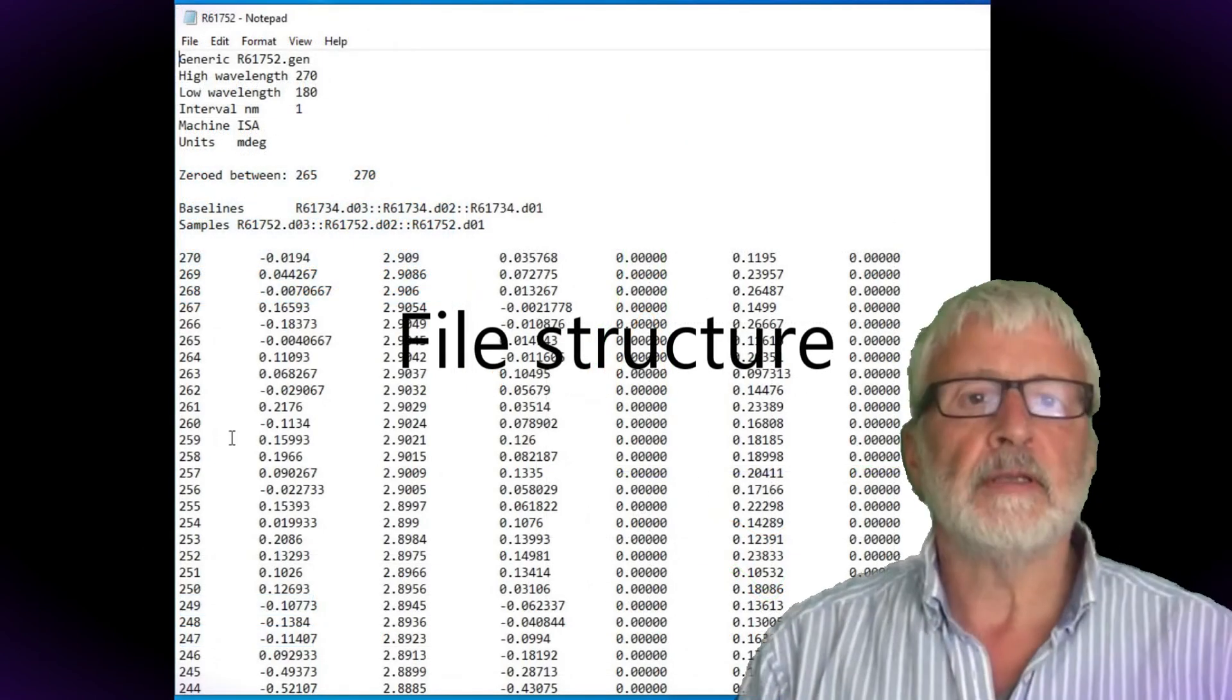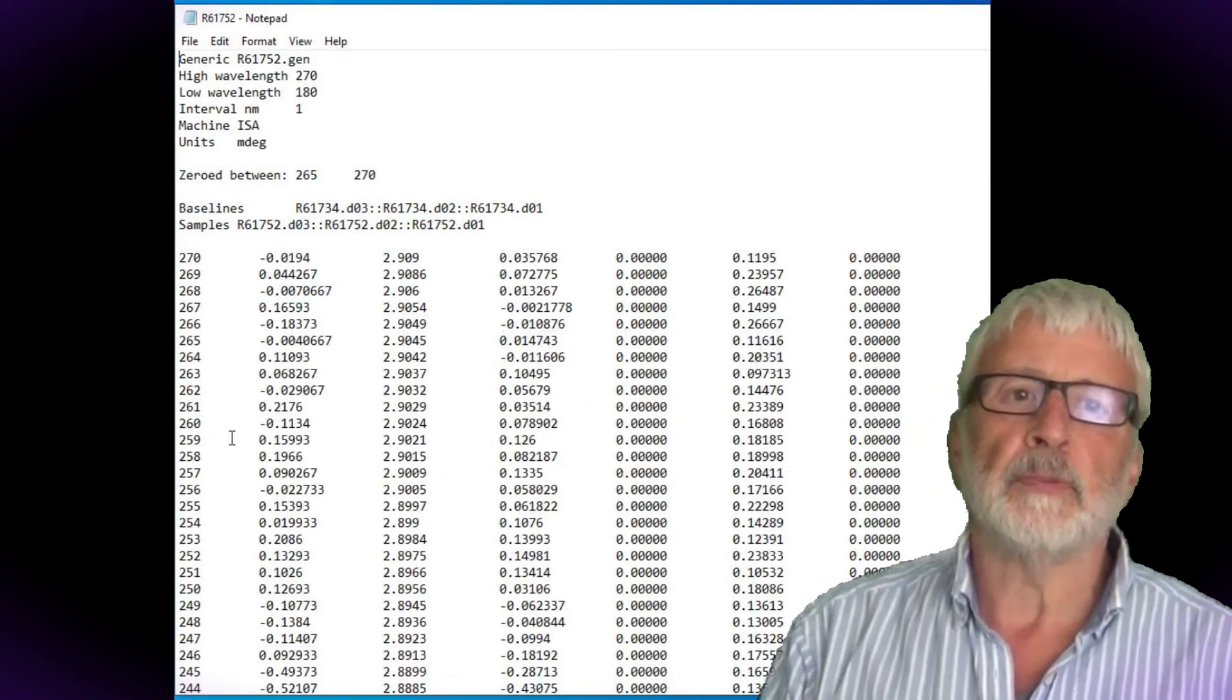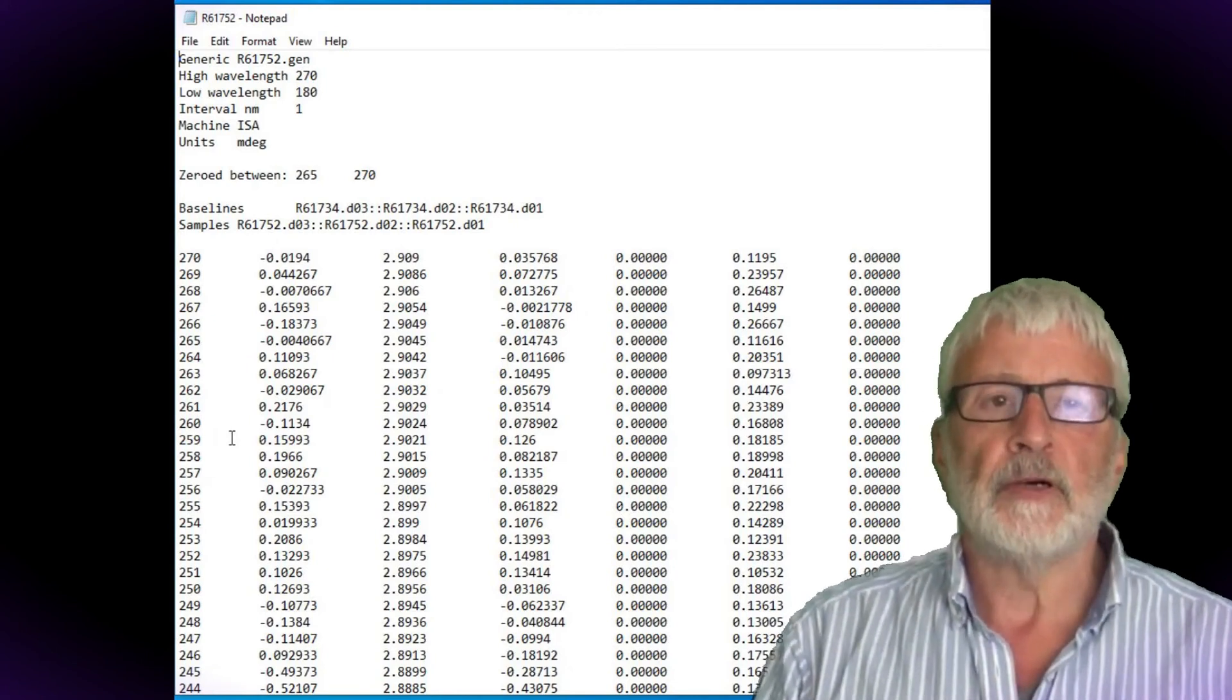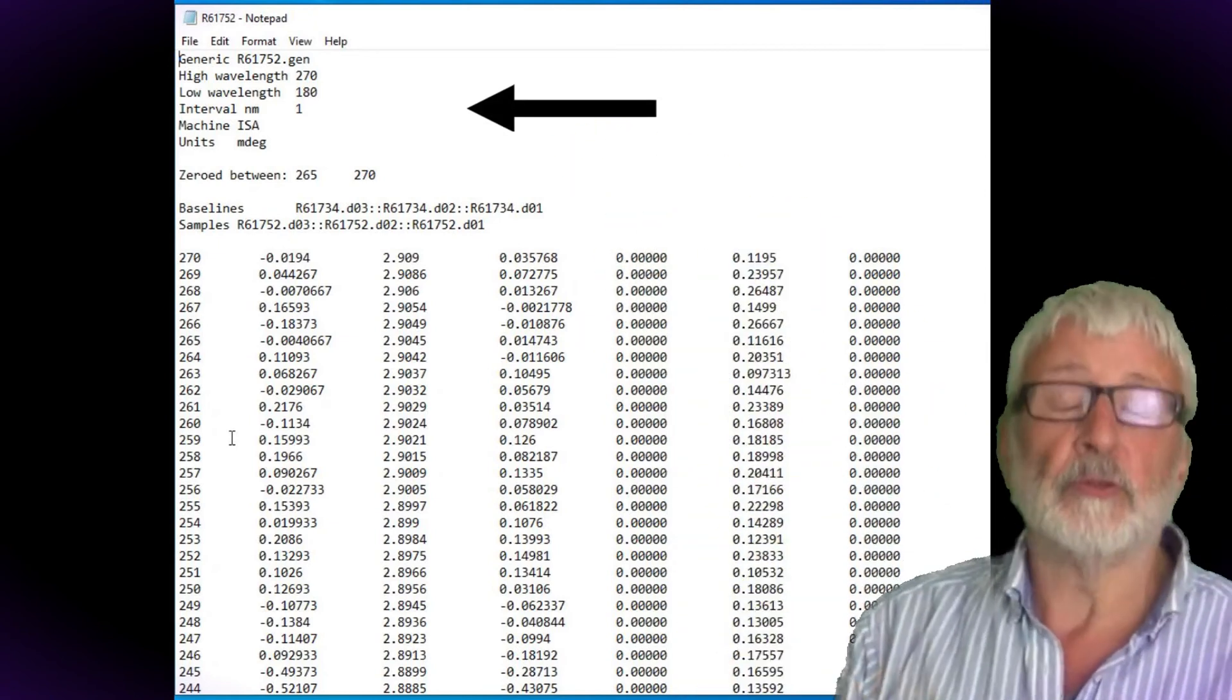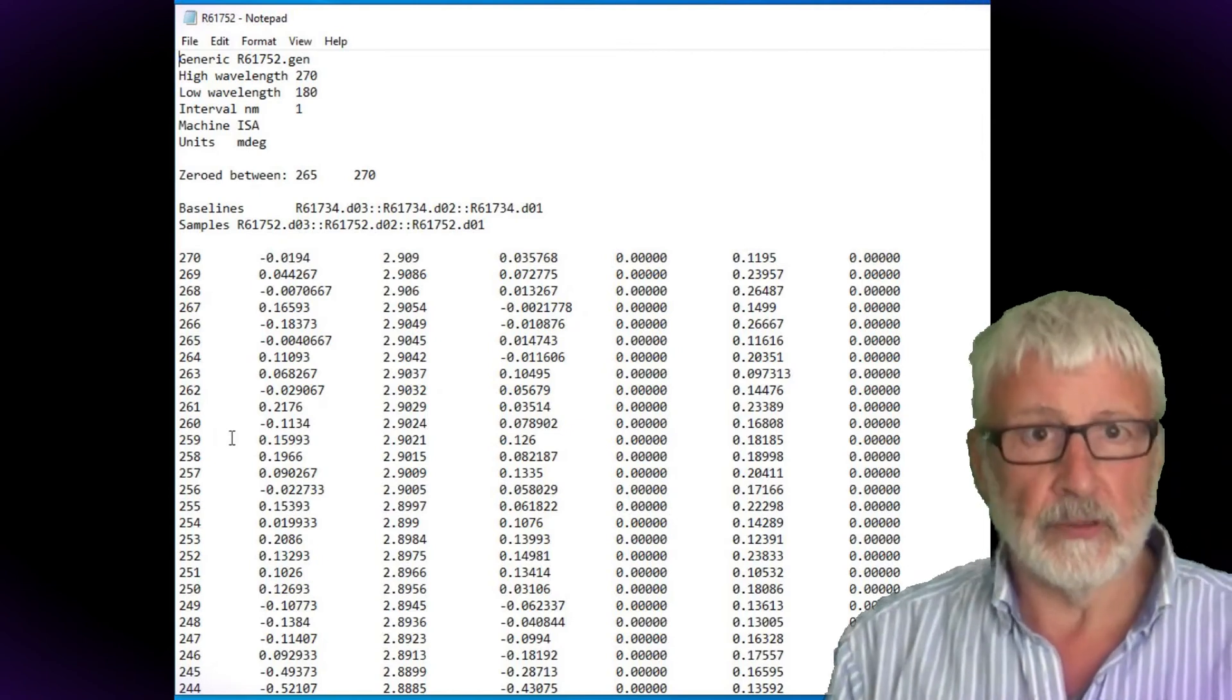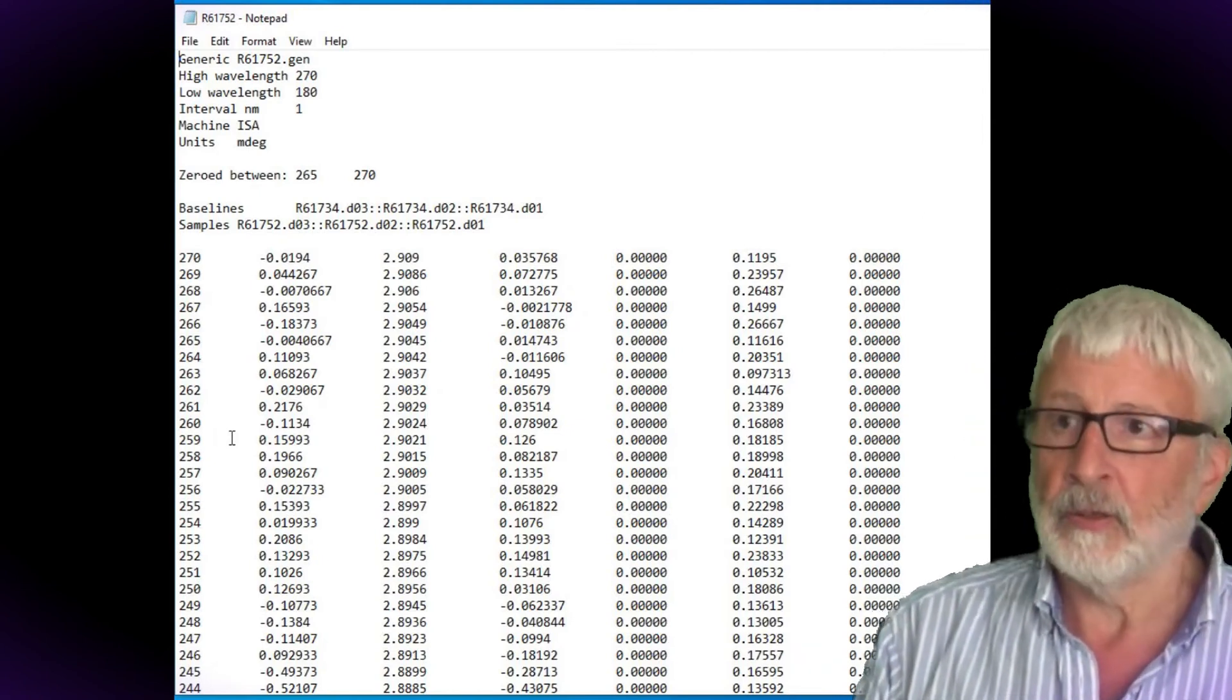Files are saved as .gen files which can be easily opened in spreadsheet programs such as Excel. Each file contains a header which contains the metadata which can be augmented in a wizard within the program itself. I'll show you how to do that in a subsequent video.